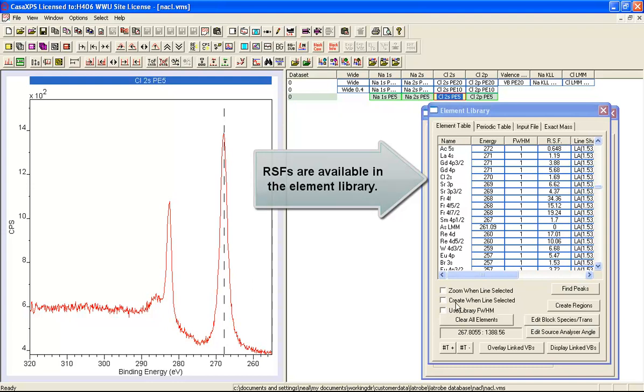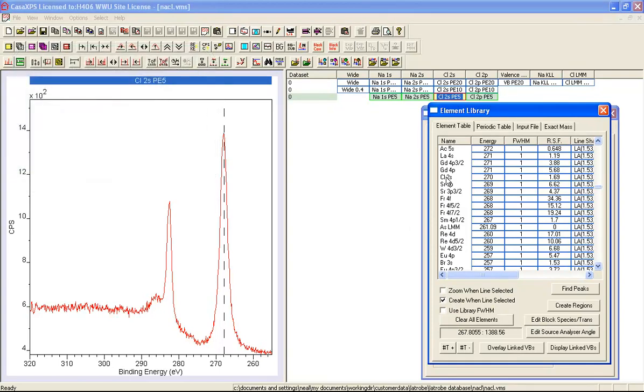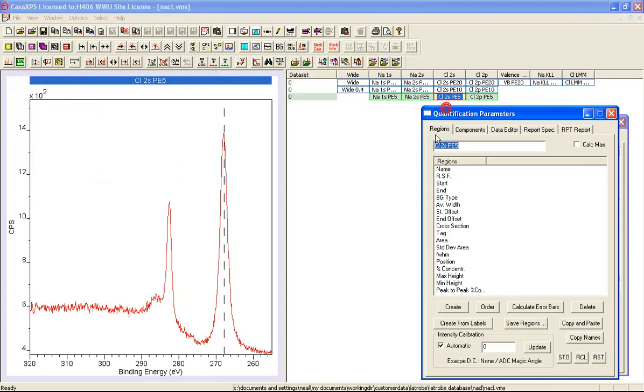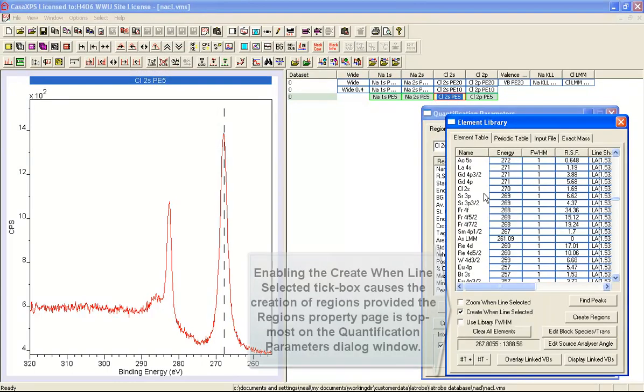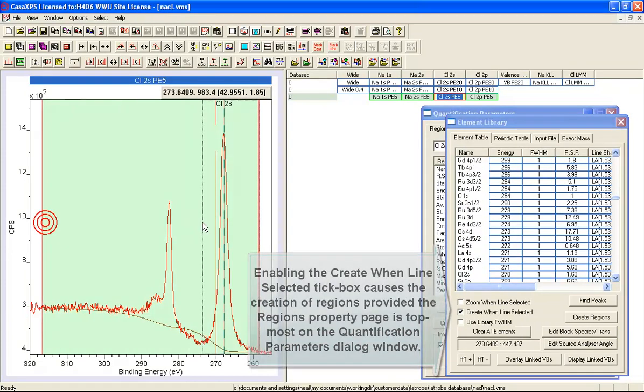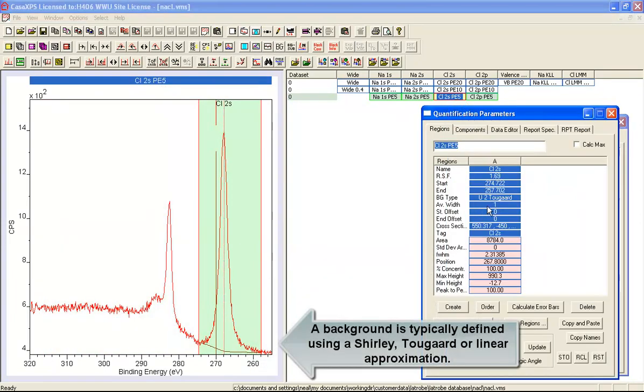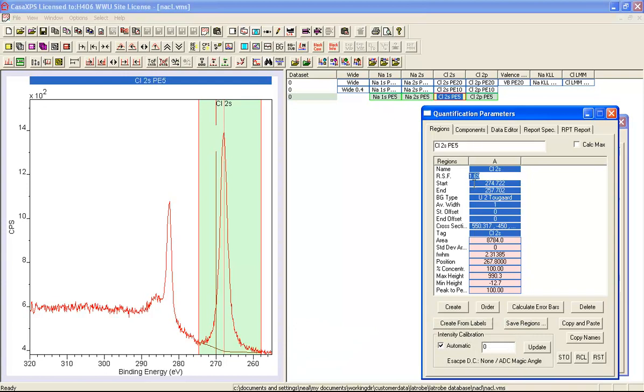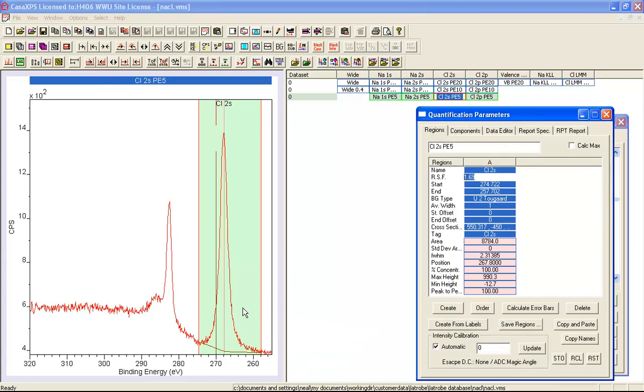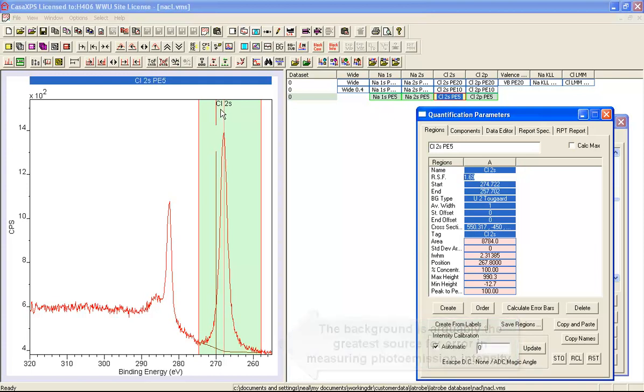We will first of all create a region and we'll do this using the option where it says create when line selected. So when I have as the topmost the regions property page, if I select this chlorine 2S transition in the element table then a quantification region is created with the default background type. It's brought in the relative sensitivity factor from the element library and we've now part of the way to working out how to scale the area above background so we can compare the intensity from the chlorine 2S with the chlorine 2P.